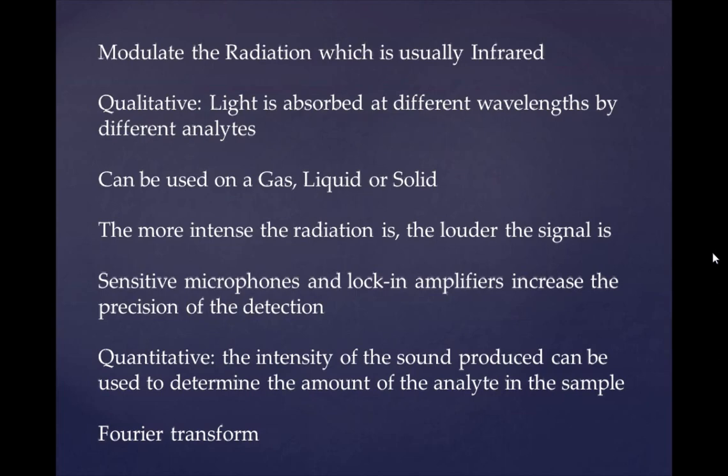Furthermore, since different substances absorb light at different specific energies, photoacoustic spectroscopy can be used qualitatively to determine the components of a gas, liquid, or solid depending on the wavelength absorbed. To achieve pulsed high-intensity narrow wavelength, a tunable laser is usually used for the spectroscopy. Very sensitive microphones are used to obtain precise detection of sound waves.